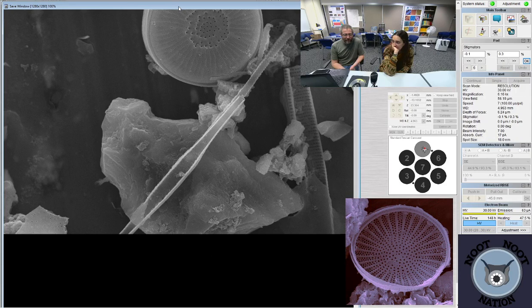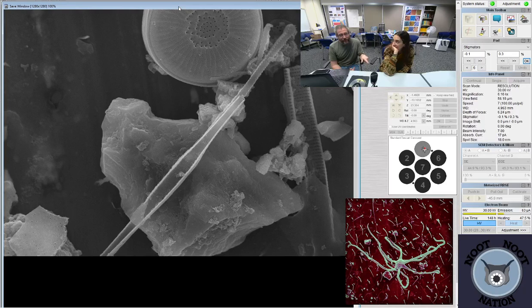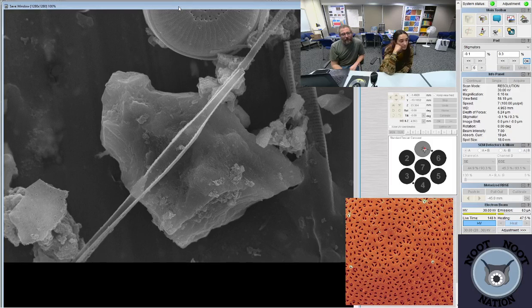And when we go to open the chamber, because it's currently in a vacuum, we need to get air into the chamber to equalize the pressure. And if we just let air from the room in, all of the dust and hair and pollen and whatever else that's in the room would get sucked into the chamber. And because what we're looking at is mostly dust-sized particles, that's usually bad.